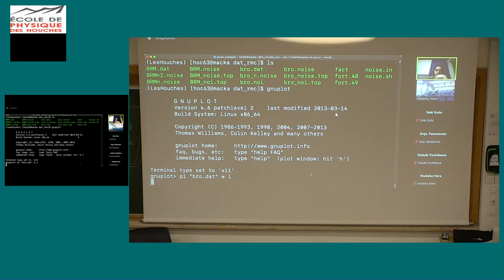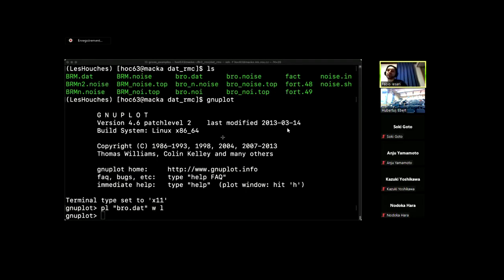It takes some time, but basically we'll have the so-called chi of k, as a function of k, of the excited photoelectron wave vector. So in this case, this is our experimental signal, and you can see, especially at high k, there is some noise.